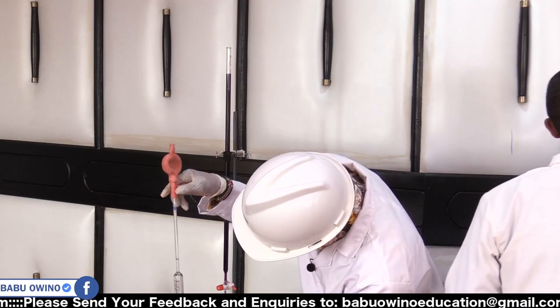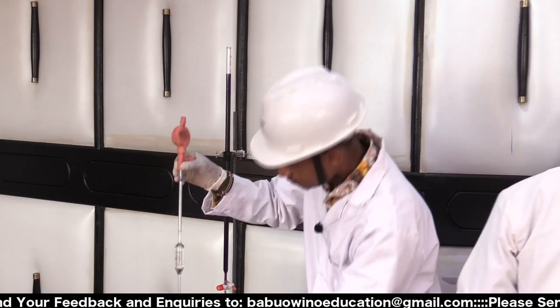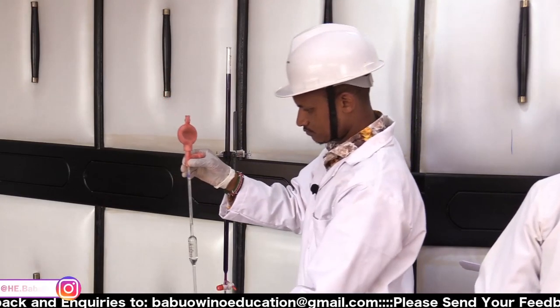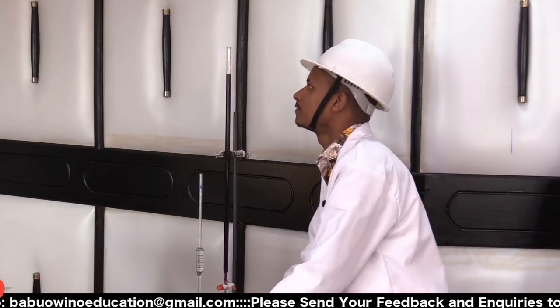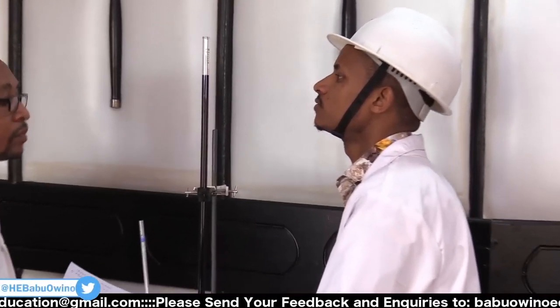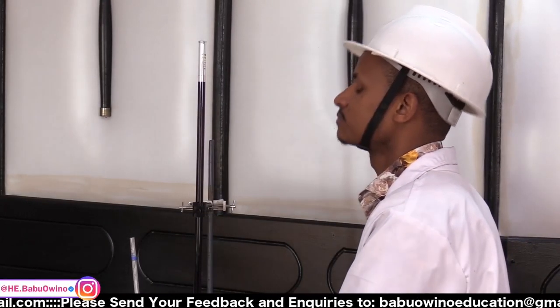This is the first titer, the second, and maybe the third, if our solutions allow. We can label them like that. Initial reading. Our initial reading is 1.2. Remember, if you're working together, confirm.